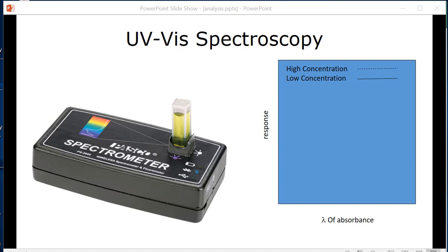The focus of this video is to help you utilize your Excel spreadsheet to solve a lot of problems, especially in spectroscopy. In particular, I want you to understand that there's various types of spectroscopy. What you're doing in the lab is UV-Vis spectroscopy, but I want to just show you it has a crossover to a lot of spectroscopy. And the key to running spectroscopy is to understand that you need to make a good calibration curve.